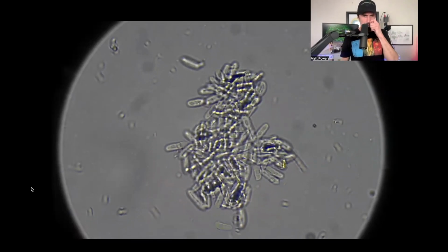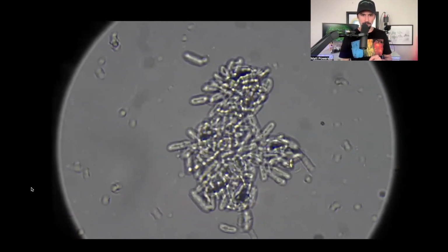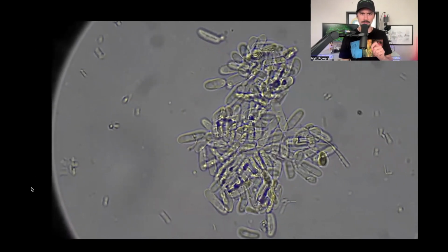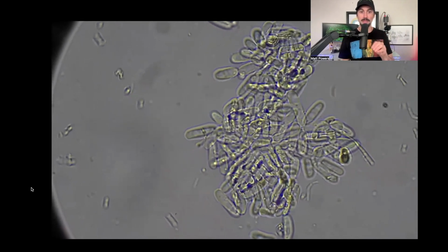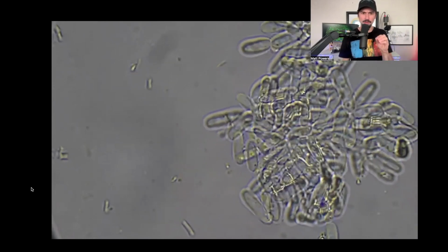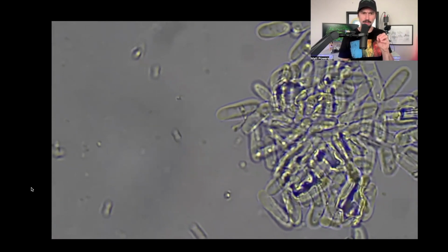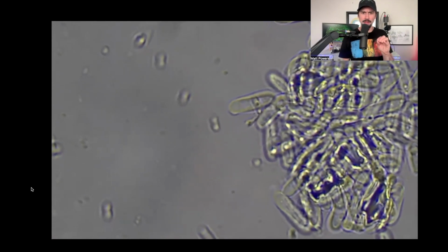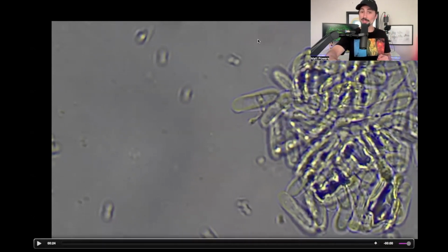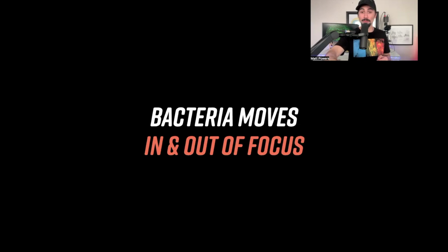And if you look here at the small dots, do you guys see how things are coming in and out? They're traveling by, they're blowing up like the pool effect where you drop something in a pool and it goes down and it gets bigger. You have those things distorting the sizes of them. And then when it's a really, really fine dot, that's it in focus. And so they're swimming in and out of range. And just counting is like, wait, is this one that's swimming now over here?